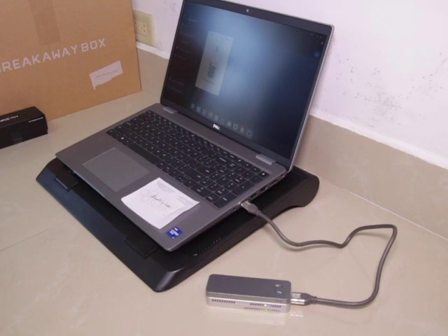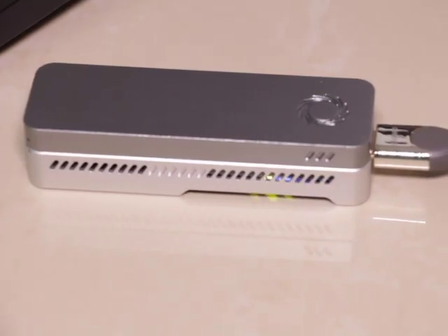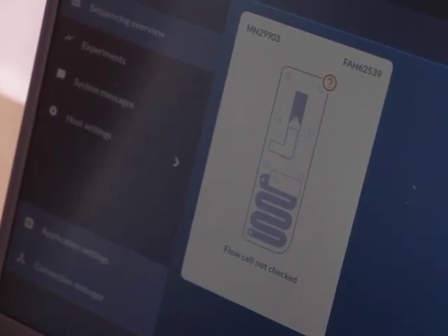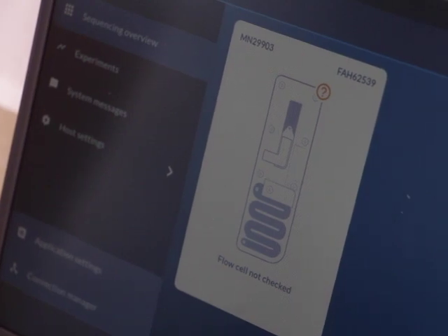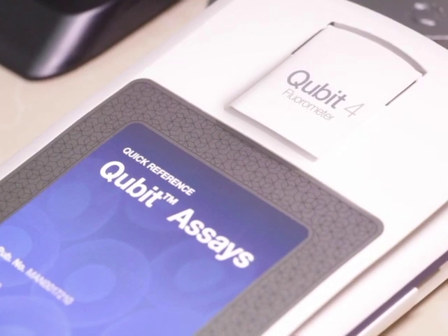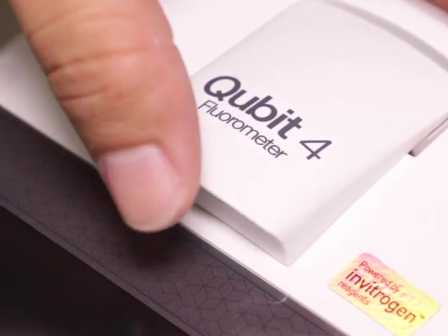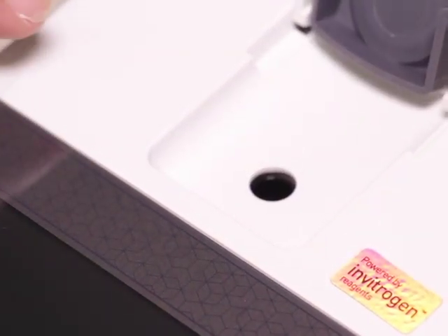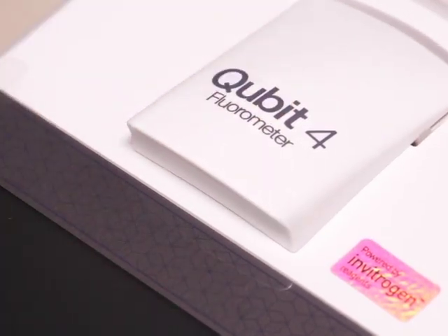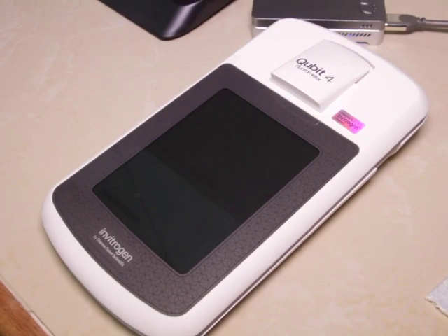In this case, Melendez will focus his efforts on detecting COVID variants. This nanopore sequencing machine plays an integral role in the process. Linked to a CPU, it generates the data from different strains necessary to run against a global database of variants already detected. Medical field speaking, the research doesn't necessarily generate any data for the physicians to create a treatment for it, but rather just to enhance surveillance in Belize.